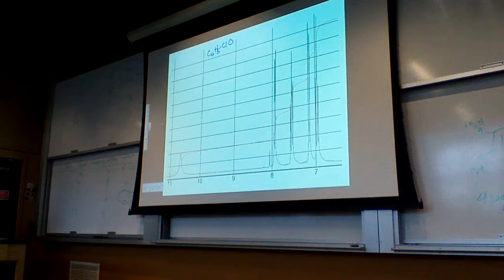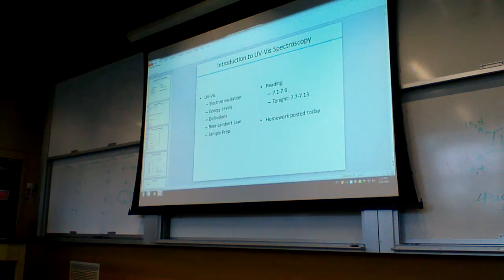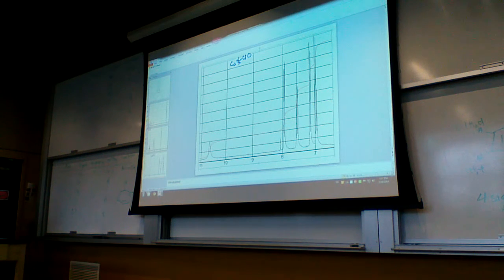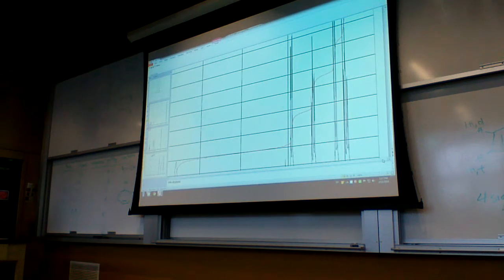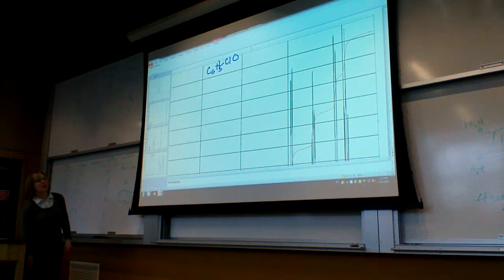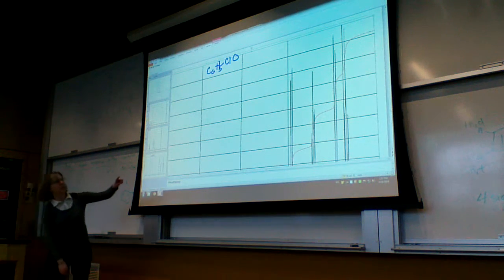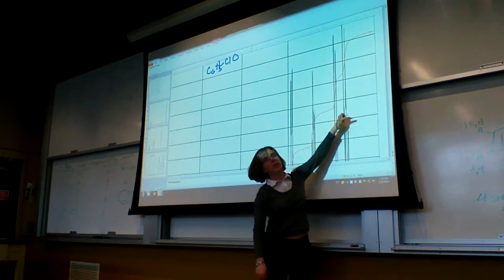The problem with this one is the line of the graph. It's really dark. I can zoom in really close. The line of the graph is, of course, just right at the same area as our peak, and so you can see where it stops going up and being dark is right about there.